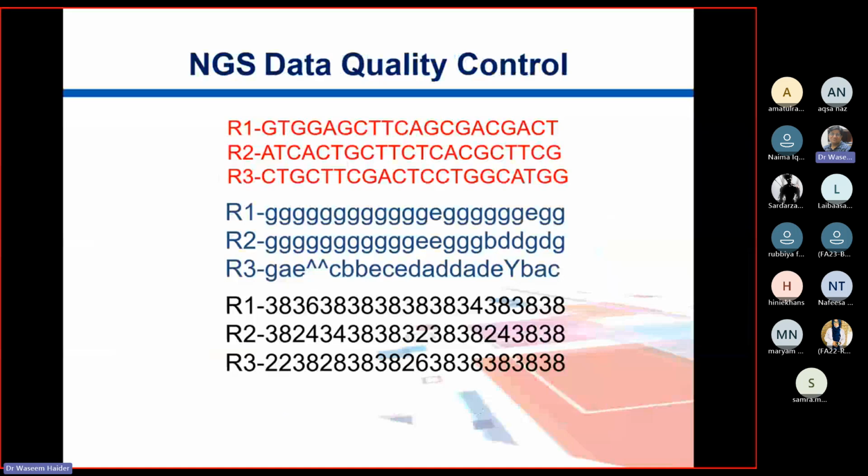we talked about box plots. So here what we do is you take those nucleotide compositions, you take those reads, and in parallel you also take their quality scores, and then those quality scores are translated into the actual scores. Obviously their ASCII value minus the offset, and that's your actual score. By the way, these may not be corresponding exactly to this. This is just an example which we created just to let you know that this thing is happening.